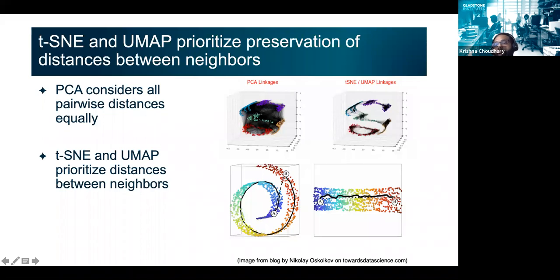While points which are close together have a link, and the links get weaker and weaker as the points get further away. With that kind of approach, t-SNE and UMAP can preserve the local structure of the data and can unroll things like the surface in 2D, where blue points are together and closer to the yellow points than they are to the red points in our 2D embedding.